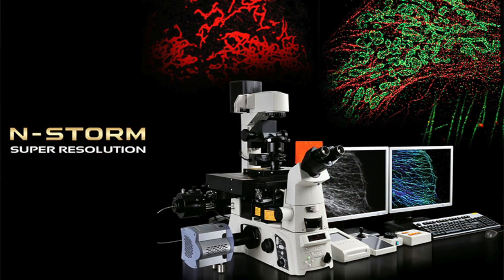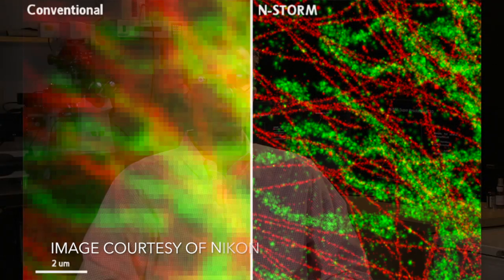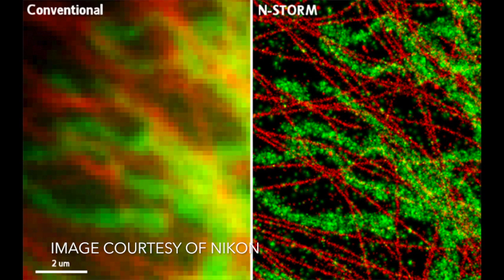So the STORM system, or the STORM platform, also known as stochastic optical reconstruction microscopy, offers us an ability to resolve structures within cells down to 20 nanometer resolution, which is quite exquisite when we think about subcellular structure. This is technology which has been rapidly evolving over the last few years with many different iterations of this particular technique, which we can address on this platform in a very exciting addition to the Center of Excellence here.